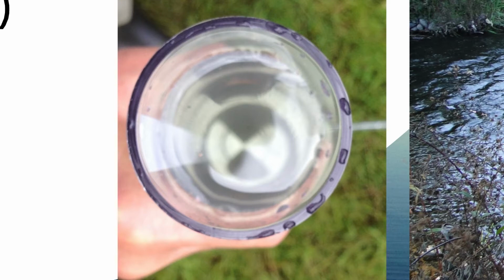If you cannot see the Secchi pattern, once the spout's valve is open, keep looking down through the water column until you can just barely see the pattern. At that point, stop emptying the tube and record the number of centimeters you can see through the water.